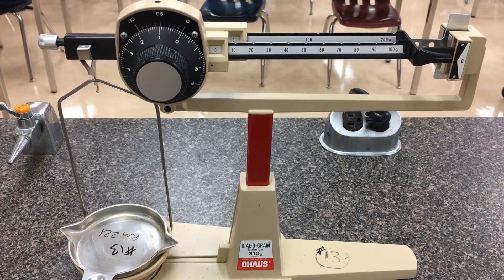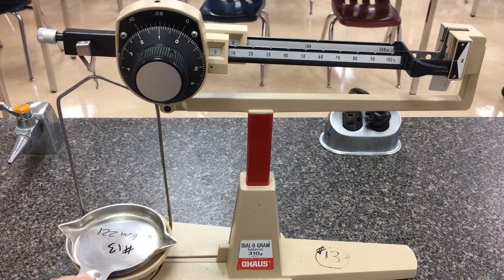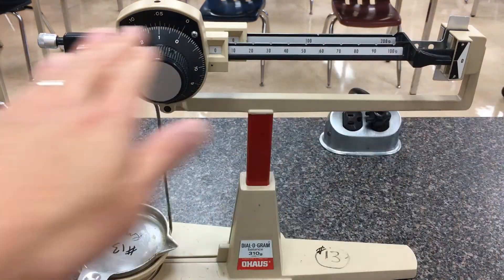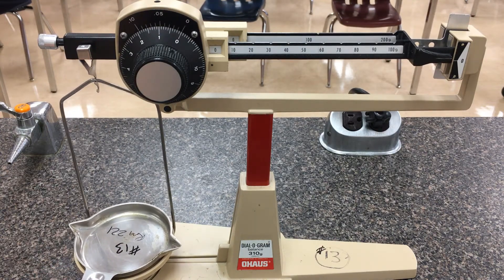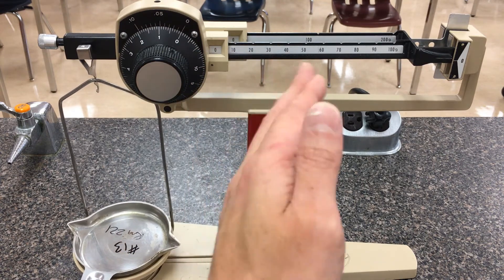Hi everyone. In this tutorial we're going to be looking at how to use a Dial-O-Gram balance. In front of us here is our scale. Whatever object you want to weigh, you're going to put it on the left hand side. There's a pan you can detach and pick up whatever masses you want. There's a lever arm here that's horizontal right now and rocks back and forth. The idea is you're going to weigh down this lever arm on the left hand side and counterbalance it on the right hand side, which is already scaled for us.